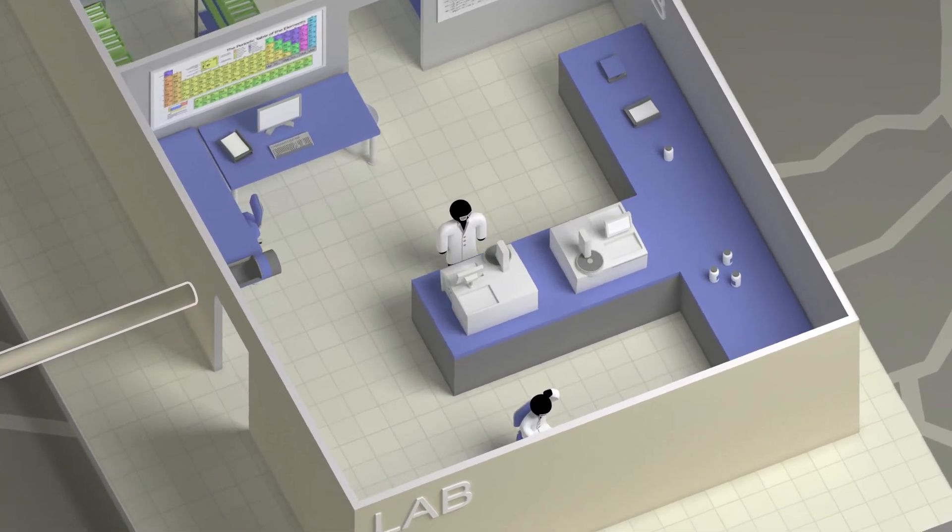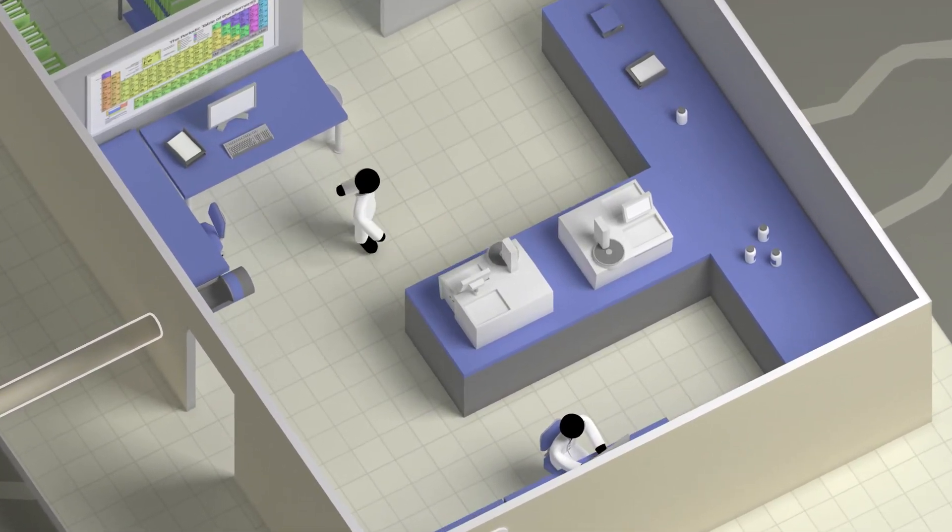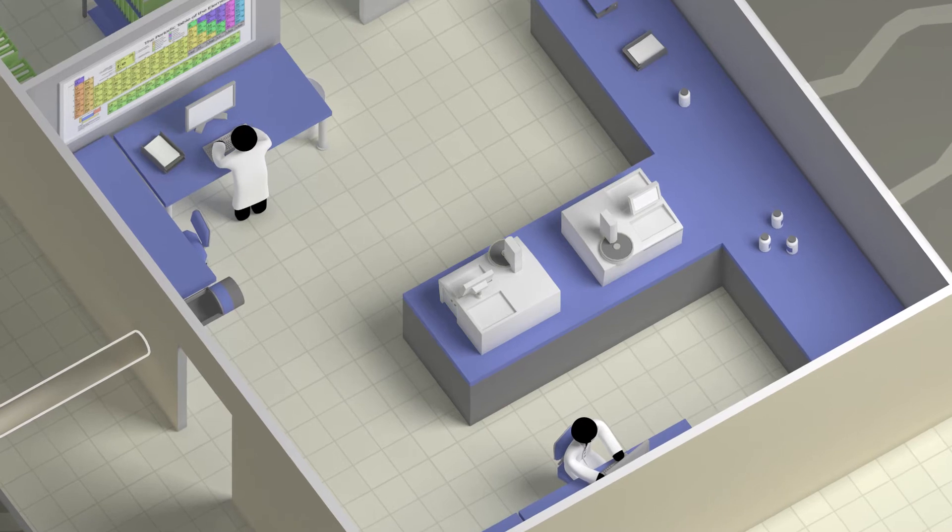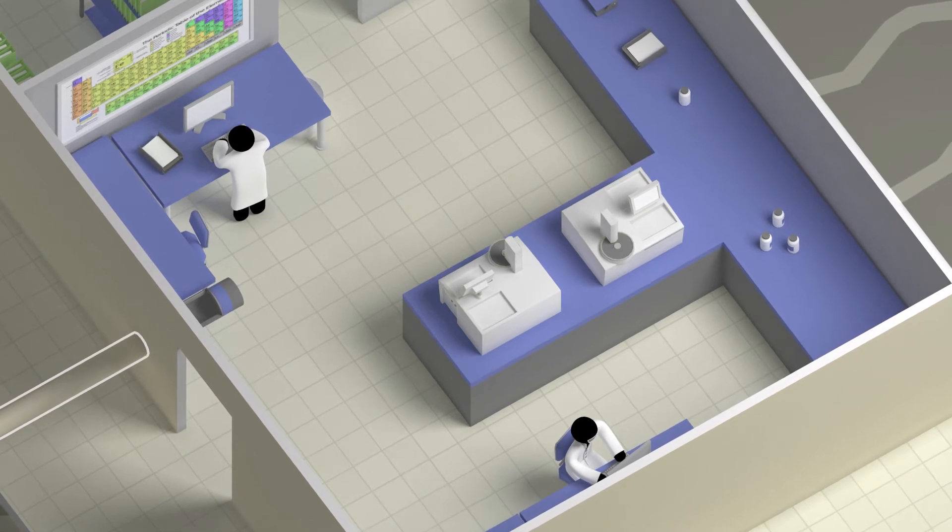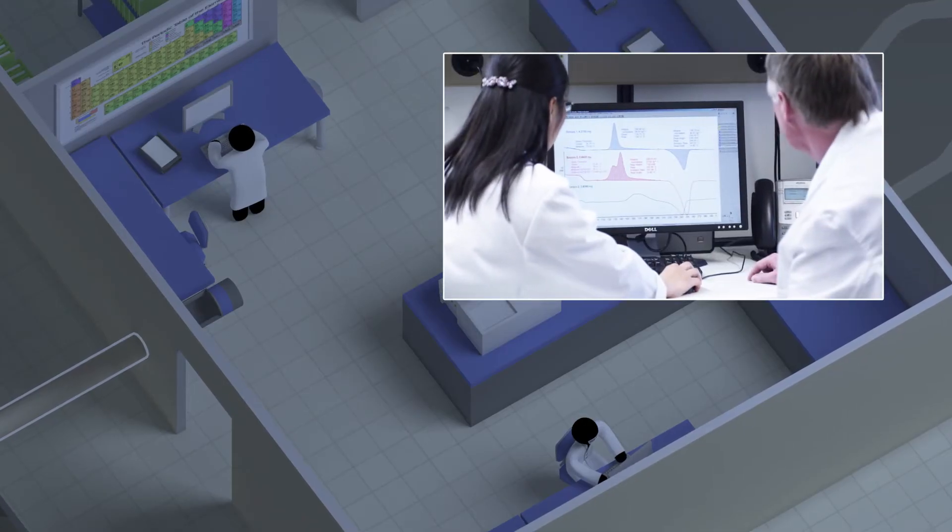From the sample preparation, method definition, experimental setup, measurement, evaluation, and interpretation.